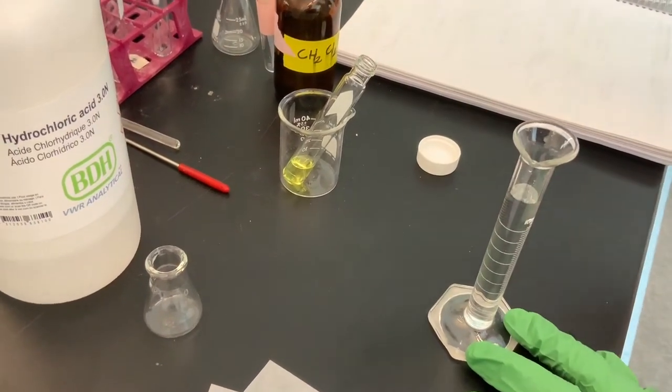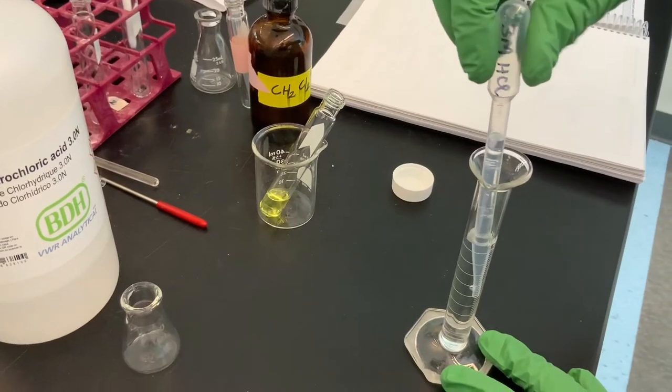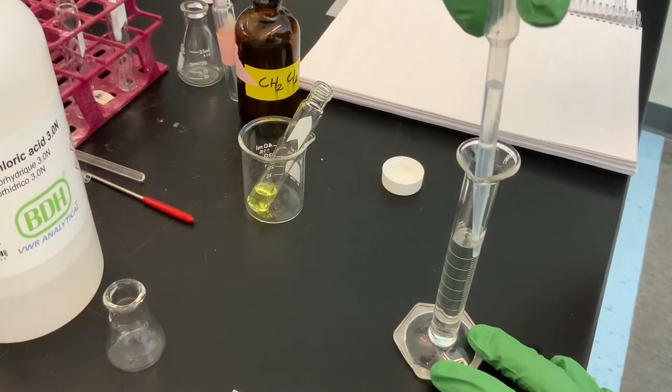Okay, so once again, I'm using the disposable graduated pipette, and I'm looking for 2 milliliters.